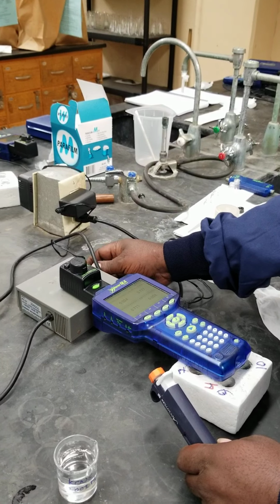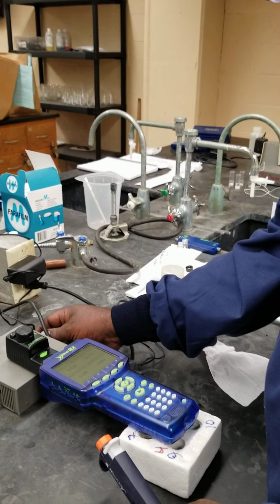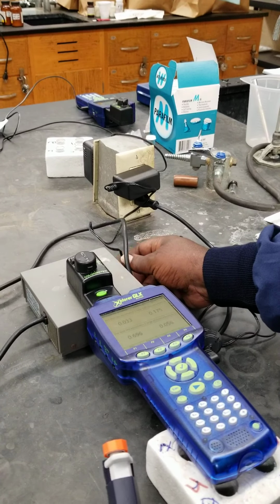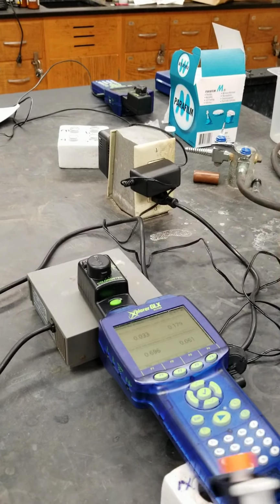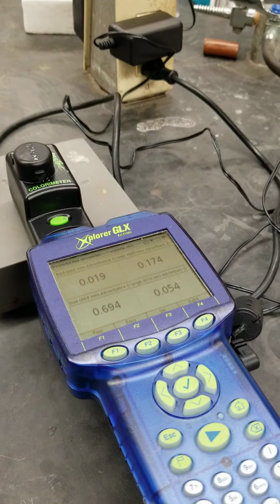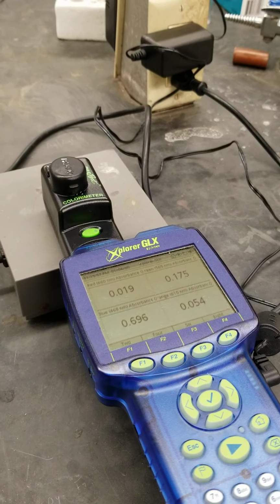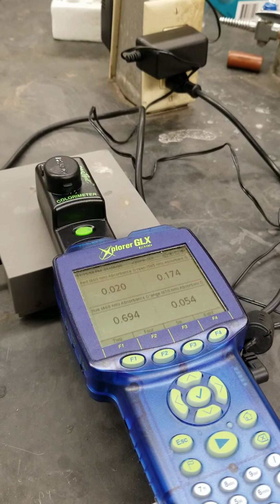This is the fifth addition. Absorbance is 0.694.